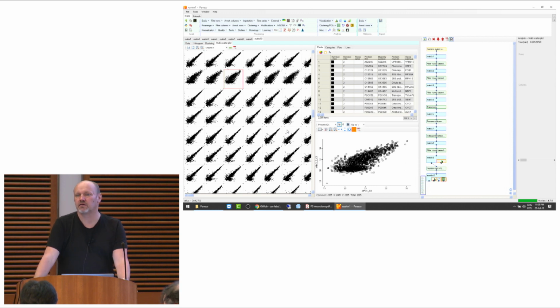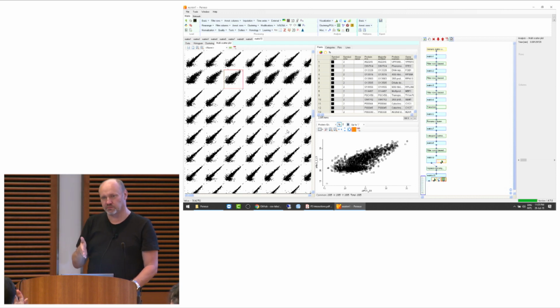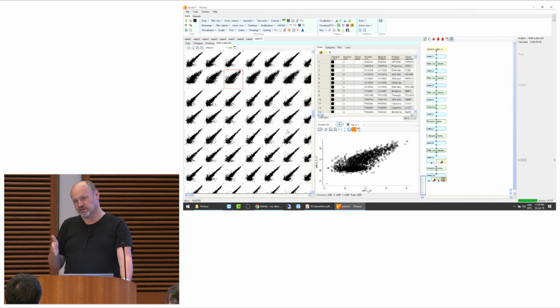Regarding the imputation, can you explain what the difference is if you did it via the total matrix like you did versus separately for each column? Yeah, exactly. So it's pretty much what the name says. If you say total matrix, then you would calculate this normal distribution based on all values in the whole matrix. While if you do it by column, then for each column you would calculate the normal distribution separately and impute separately.